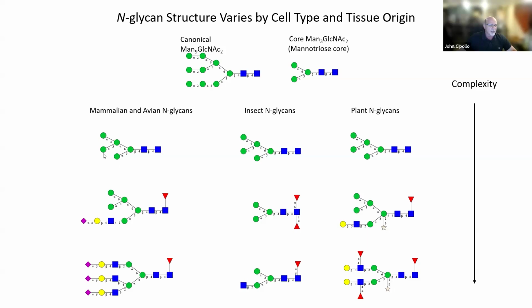If the high mannose glycan is not completely processed or is not exposed to all the enzymes, you can have a hybrid glycan, which is a mix between complex and high mannose. And then in some of the more complex processing, hence the name complex glycans, you can give rise to multi-antennary glycans with a range of different monosaccharide components.